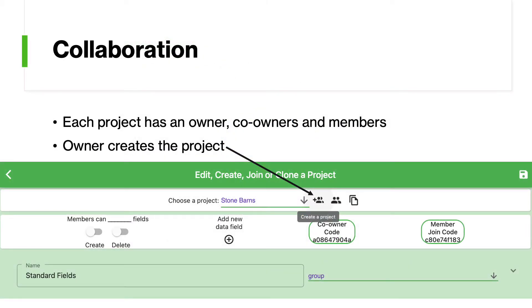Let's focus on the collaborative aspect of project management. There are two types of project members: co-owners and members, and each type has different privileges regarding editing the project.